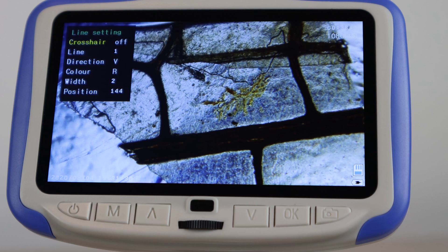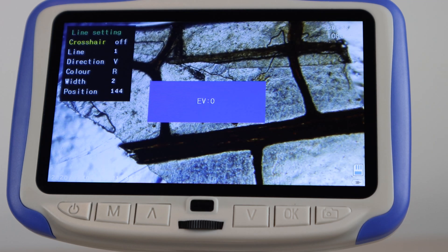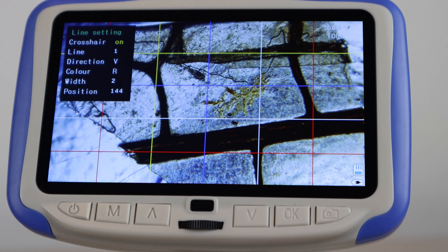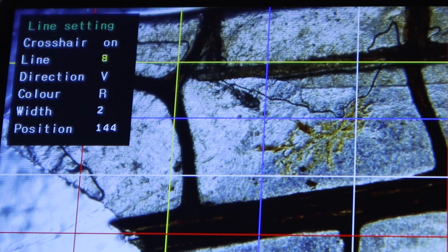The grid line feature is interesting because it allows you to add and customize 9 on-screen lines when you turn on the crosshair option. You can adjust the settings of each line individually, which is assigned a number.